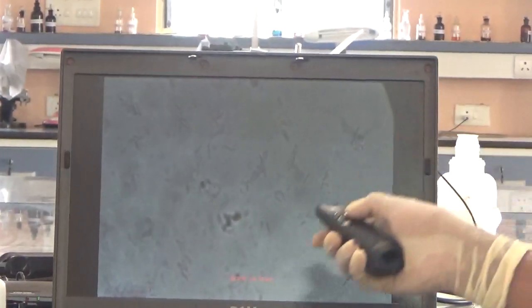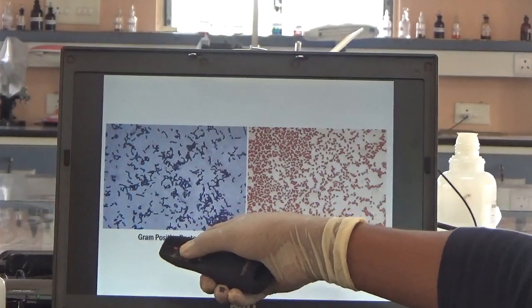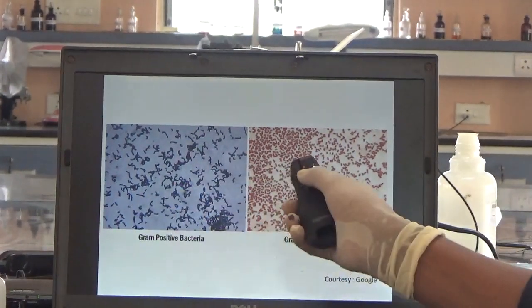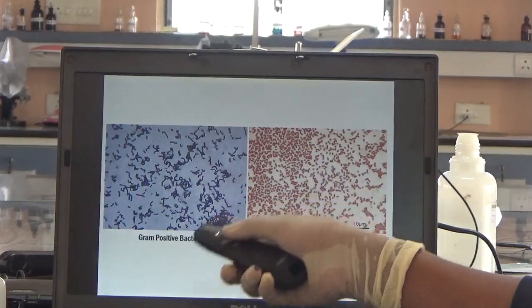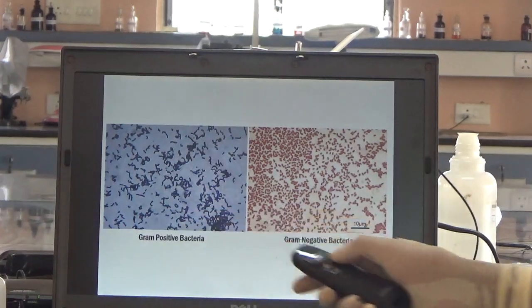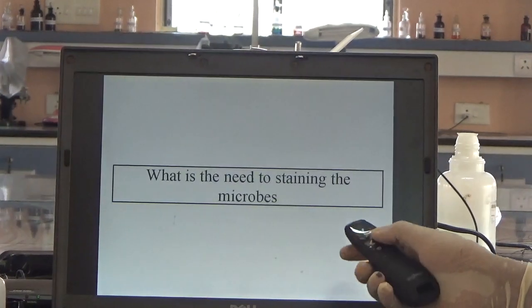On the right side you can see the Gram positive and Gram negative stains. On the right side we have Gram positive and Gram negative organisms — Gram positive on one side and Gram negative on the other.